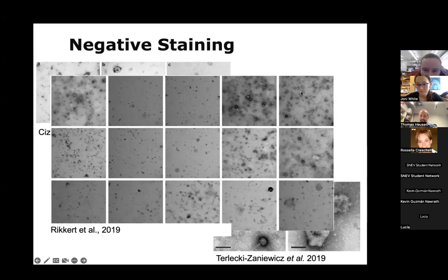Very similar to what I've got. And if it were plasma EVs, I would think first of all it's maybe lipoproteins, but my sample is just bacterial extracellular vesicles, which come from media, and there are no lipoproteins, no other source particles. So I'm still questioning myself. What do you think about this?